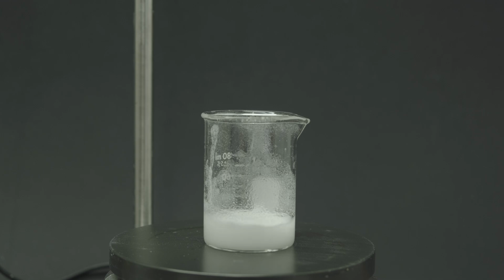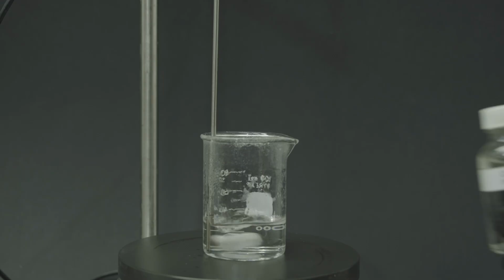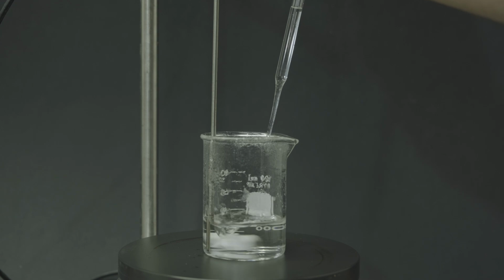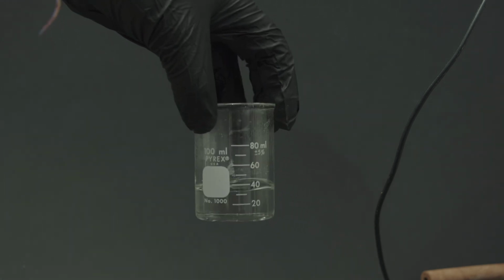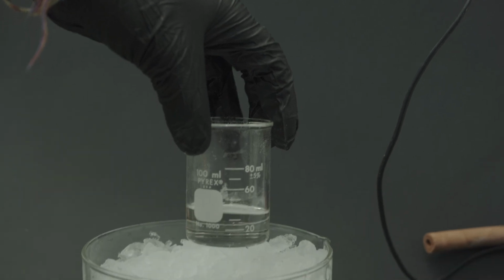for everything to dissolve. Once my solution had turned clear and it was obvious that everything had been dissolved, I now knew that it was time for me to add my catalyst. I used some concentrated phosphoric acid, and I knew that I'd only need a few drops. Once I had finished adding all of my catalyst, phosphoric acid, I decided to let it stir, but then took it off pretty quick, which, as you will see in a second, led to pretty bad results.